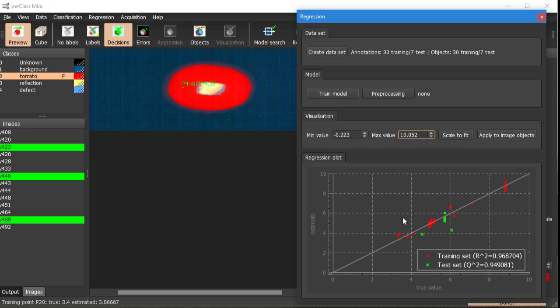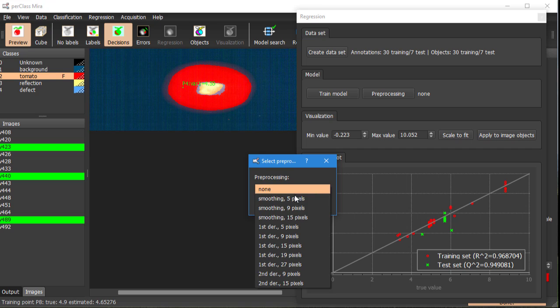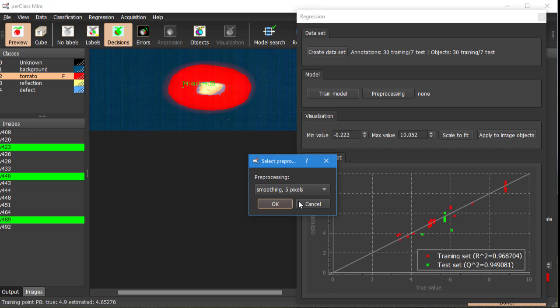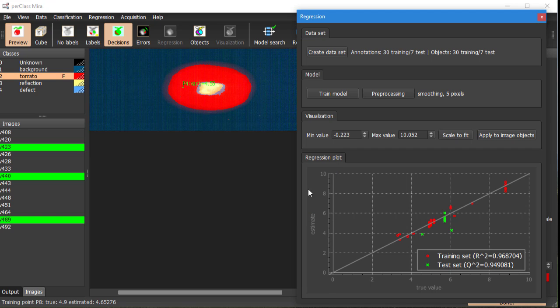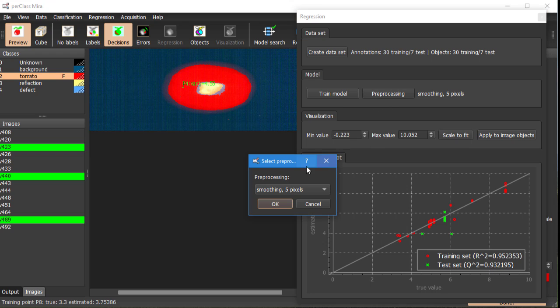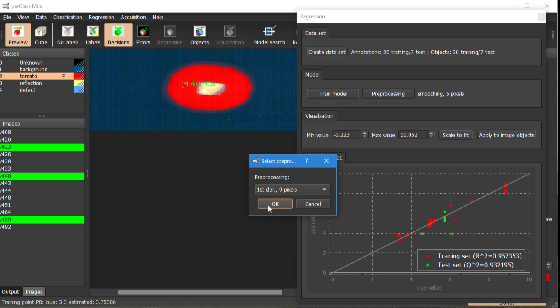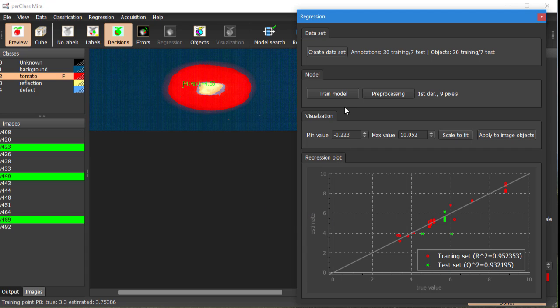We would like to improve this modeling and that can be done in different ways. One would be different pre-processing. We could for example try to smooth the spectra before regression modeling. Let's see if it helps. It actually doesn't. The important value for us is the q-square statistic. For the test examples it got a little bit worse. We would like to get it closer to one. We can try different pre-processing for example first derivative and see what happens.